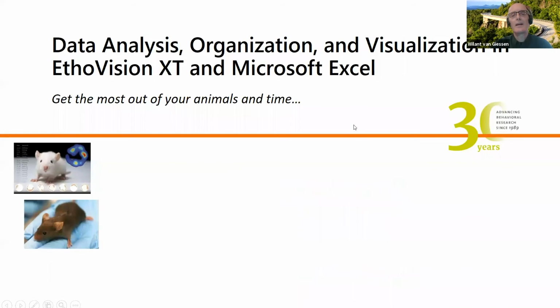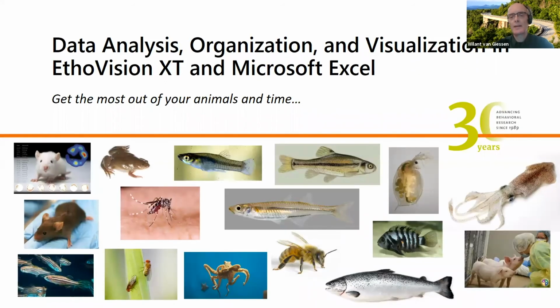Actually, the last time I did this webinar, I asked some people ahead of time what do you use EthoVision for? Well, obviously, as most of you will know, most users will use it for tracking mice and rats, rodents. But as it turns out, the list of creatures that people told me about was quite extensive, from the very small, like Daphnia, to the much larger animals like pigs. Unless, of course, this is a giant squid. In that case, that's the biggest one.